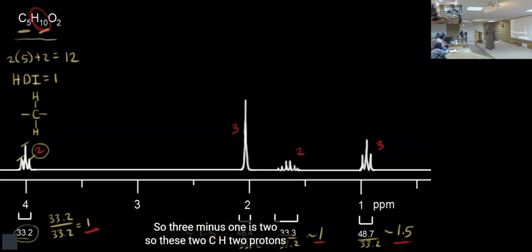Before he goes, I need to know where this comes from, the integration. How there are two protons. From the integration. When you get the spectrum, when you are processing that spectrum, as I mentioned, you have to consider something as 1 proton, 2 proton, based on your literature, experience, reported values.